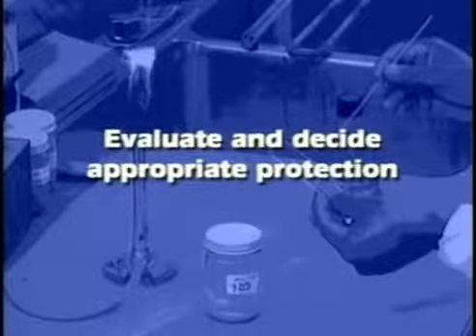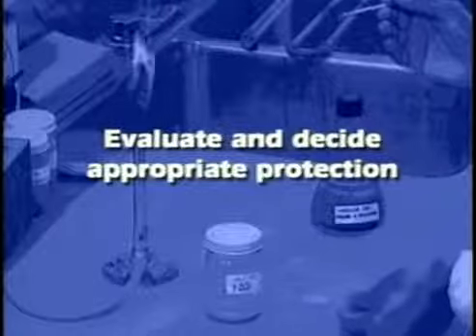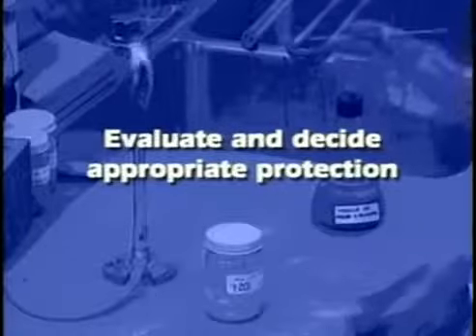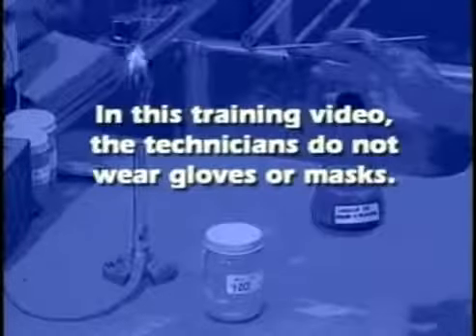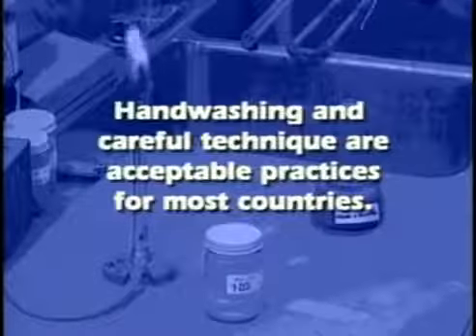Each country must evaluate the risks and decide on the level of protection that is appropriate with the resources that may be available. In this training video, the technicians do not wear gloves or masks. Hand washing and careful technique are acceptable practices for most countries. Remember, safety is everyone's concern, no matter what job is being performed.